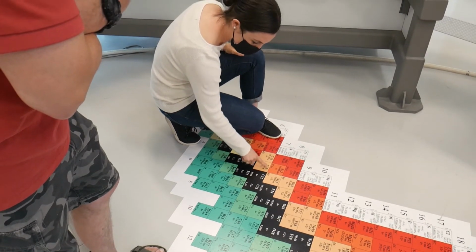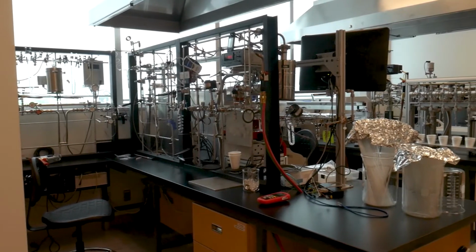And that's important because we measure them differently on the accelerator. So with these big beams of carbon 12 and 13, we just measure the total size of the beam, and then we convert that to the number of atoms. Carbon 14, there's so little of it. It's like 1 grain of sand in a huge beach. It goes down to the very end of the accelerator, and the individual atoms are counted one at a time. And so when you go into the control room and you look at the software that we use to control the accelerator, you can see a little plot, and we watch the individual atoms of carbon 14 as they come in. The calculation of a radiocarbon date is essentially the ratio of carbon 14 to carbon 12.